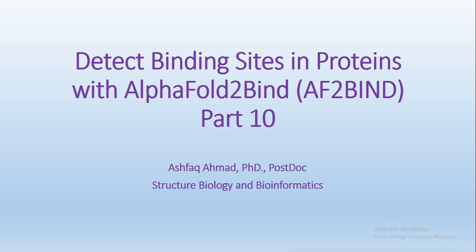Today we will learn how to use the embeddings or parameters of AlphaFold version 2, also called AlphaFold 2, to detect the binding site information for a protein for a ligand. The program we will use today is called AF2BIND, which is abbreviated for AlphaFold 2 bind.